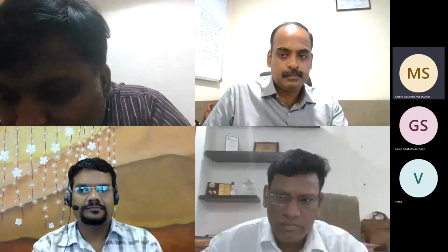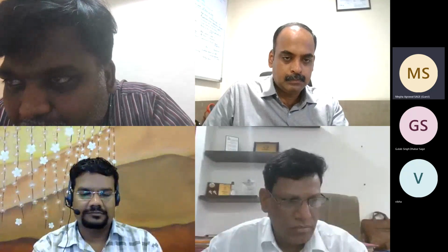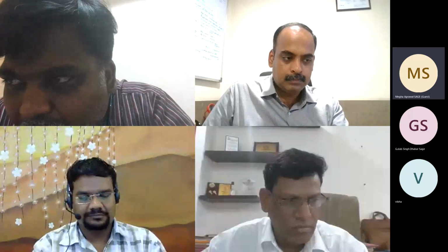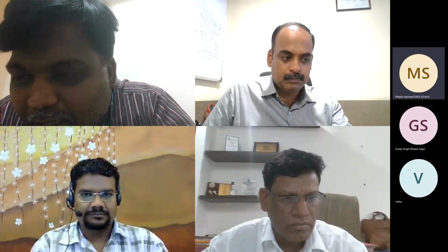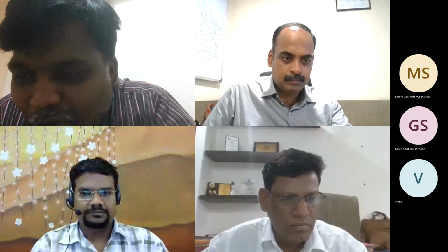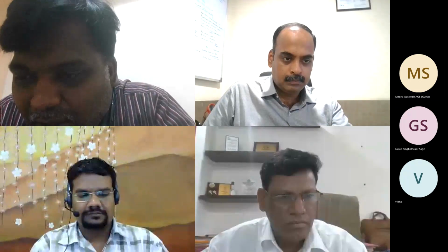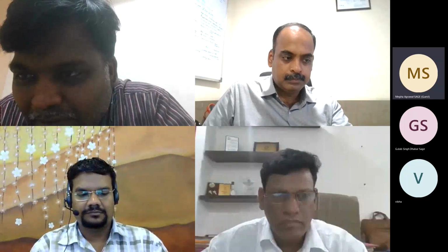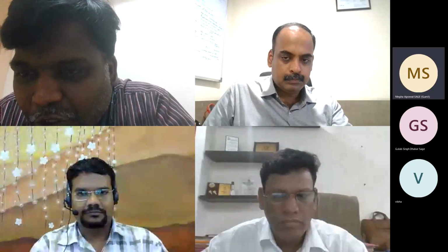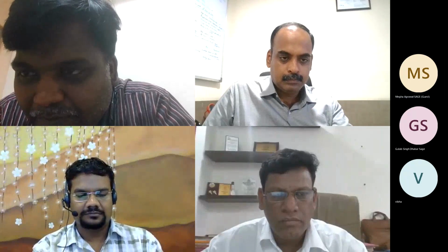Yeah, I was saying that the doctor wants to check the availability of a particular blood group and the requirement in OT, there might be emergencies. So how is all of that done when it comes to manual? No, on the billing side of transactions they used to use the blood bank solution only. Billing side. Okay. Core blood bank functionalities they are not used to using in the blood bank module. Whatever issues there are, they used to use the blood bank module itself.